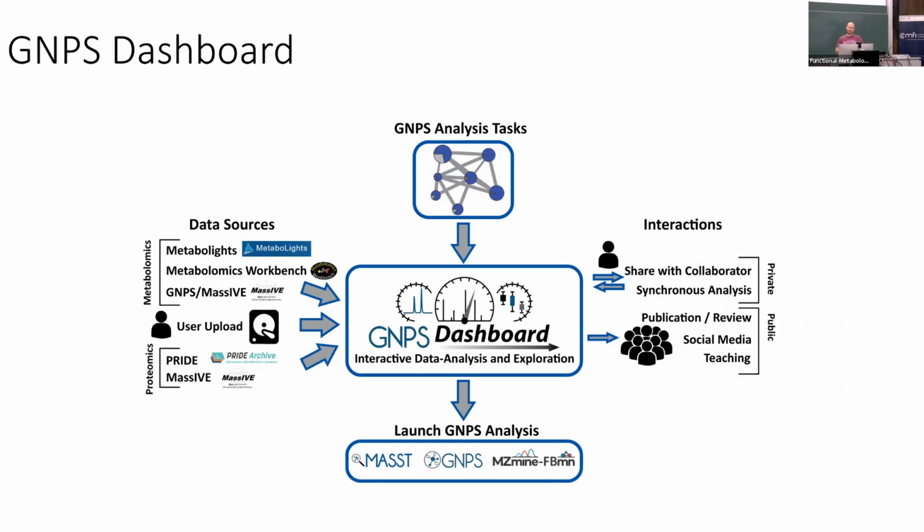And then, very interestingly, you can interact with your collaborators in multiple ways. You can simply share URLs of your visualization and somebody can click on it. Or you can also do some sort of real-time exploration, where you can actually share an interactive link with, say, the students in your classroom. And then whatever you do in the dashboard, they will see happening on their web browser in a kind of Google Doc style explorative way, which I think is also very nice.